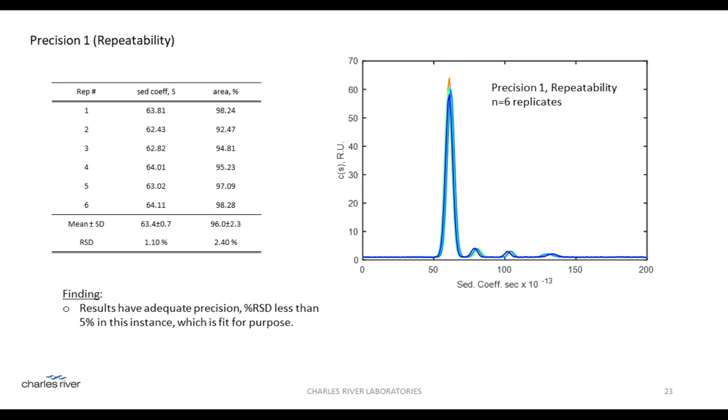Now, admittedly, chromatographic methods are able to obtain higher precision levels than shown here for AUC. HPLC may have improved RSDs over what's shown here, but the kind of repeatability shown here in both the statistical numbers in the table and the relatively good overlap between replicates, as evidenced visually by the graph showing 6 overlaid curves from the same 6 replicates from the same sample, would tend to argue that AUC is indeed very suitable for quantifying empty and full levels, especially given the very good peak separation shown here, which is quite honestly difficult to obtain by chromatography.